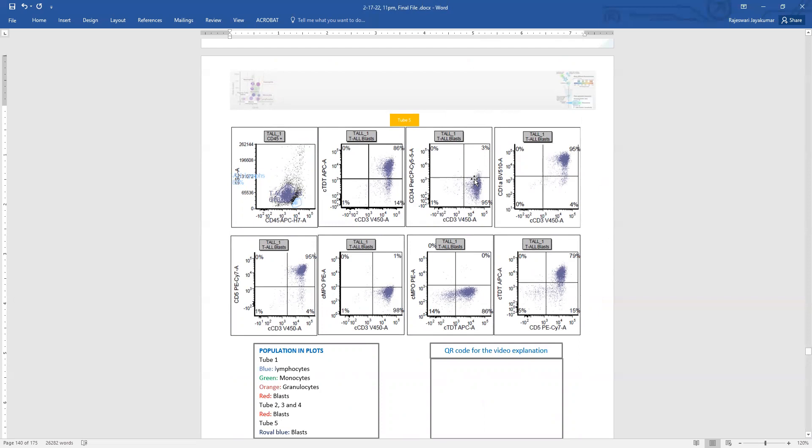So again, it shows that these are CD34 negative, and these are CD1A positive. 1A is also another immaturity marker. They are CD5 positive as expected, and these are negative for the myeloid markers MPO.